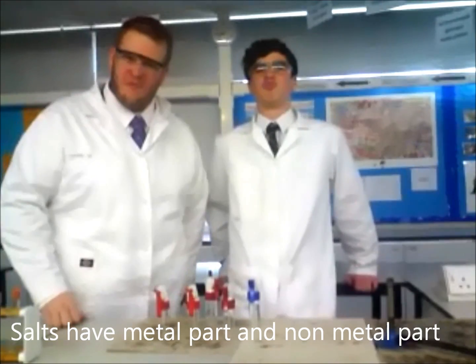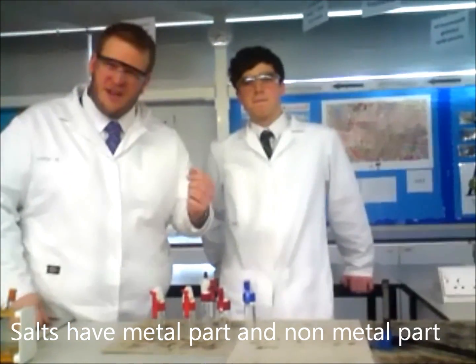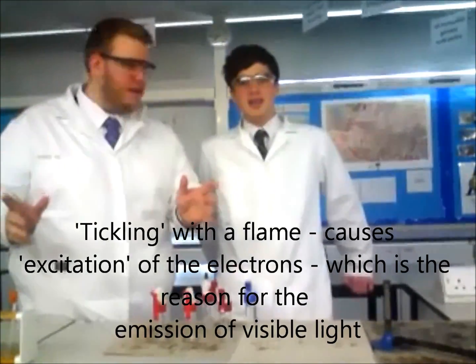What JB's going to do here is give them a flame test. He's going to give them a little tickle with a flame, excite the ions, and they're going to give out coloured light.